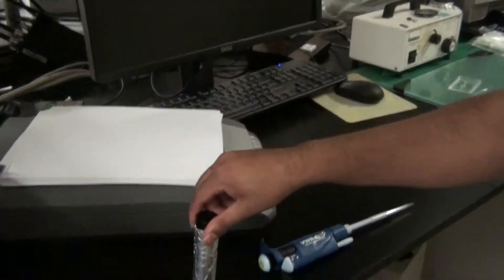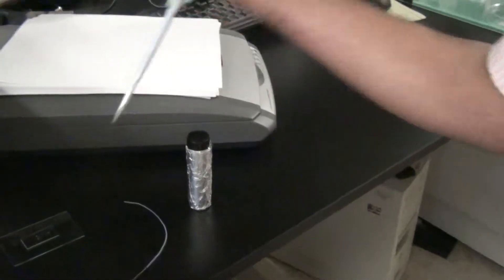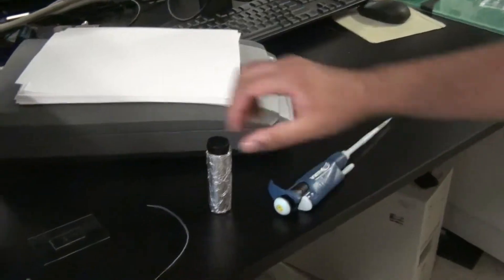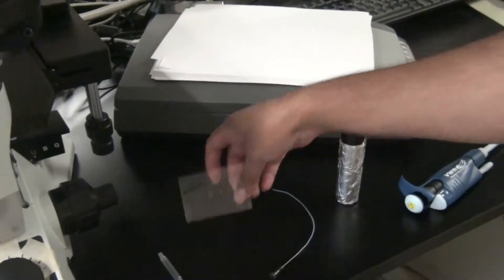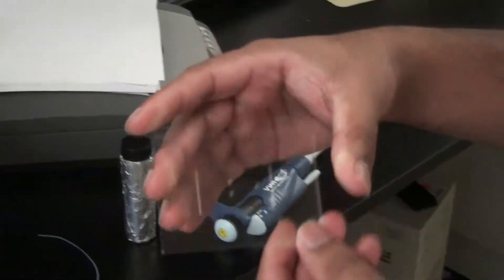We also need another syringe to help you get rid of the excess microparticles that come out of the channel, and this — this is a PDMS micro device that's created using a silicon master through soft lithography of positive features.